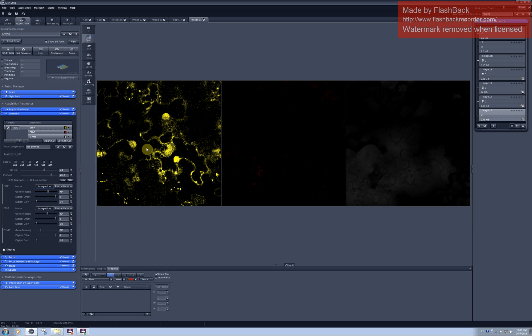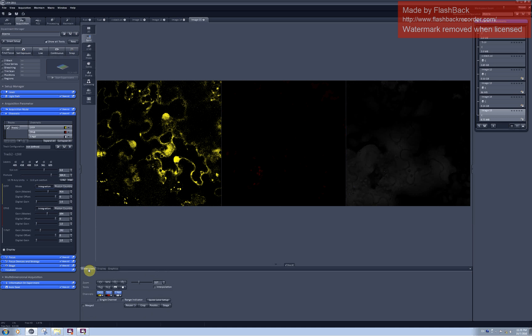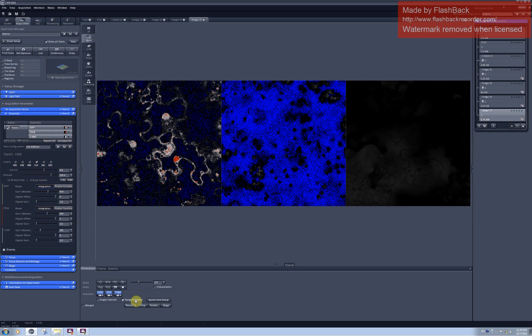I'm going to detect changes in the intensities in my sample. And I of course need to make sure that there are no oversaturated pixels on my image. For this I can go to range indicator function.